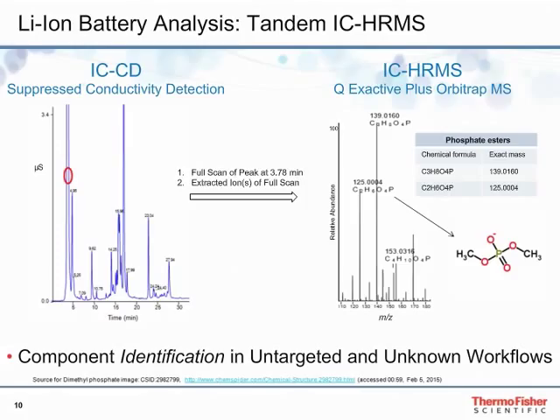On the right, mass spec results were generated from the extracted ions of a full scan taken of a peak at 3.78 minutes using high-resolution mass spec in a negative ion mode. Shown are degradation products with experimental mass-to-charge ratios ranging from 110 to 180. Elemental composition was based on high-resolution accurate mass data. The table on the far right shows elemental composition possibilities.